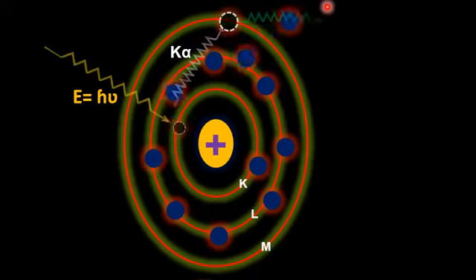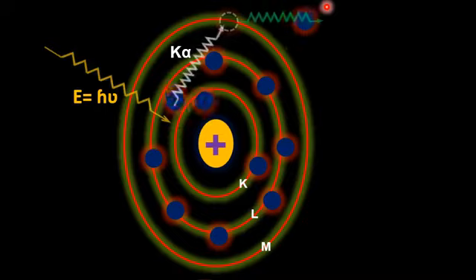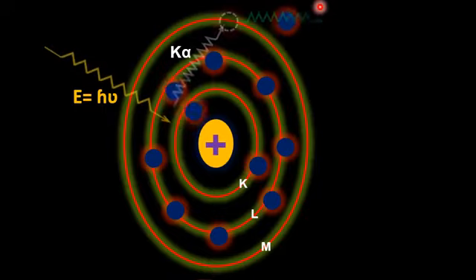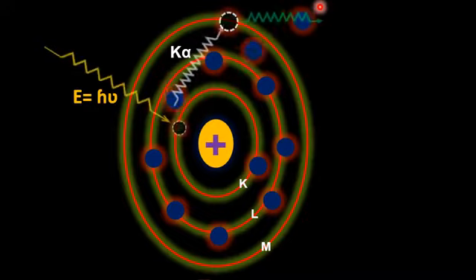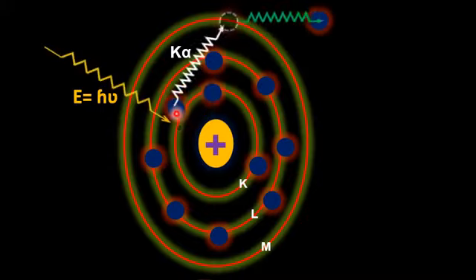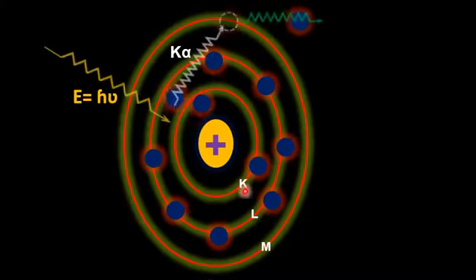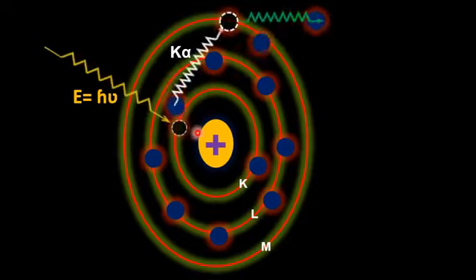Now student, the question here is how someone can determine that an electron emitted, let's say from sodium, is an Auger electron of sodium. How can you determine this in Auger electron spectroscopy? This is quite simple, dear student. Every electron in the K, L and M shells has a different nuclear attraction force, or binding force, with the nucleus in its shell.